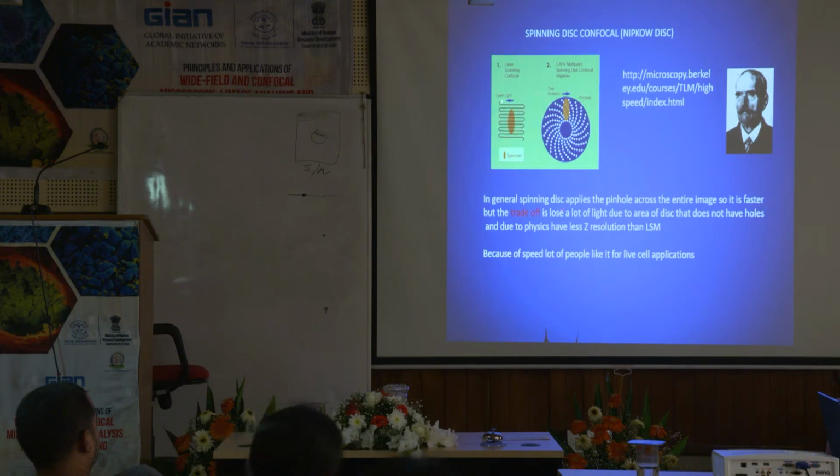Okay, but always, of course, the trade-off is you lose an awful lot of light. Like I sold one of these when they first came out, and it was hard to work with because it just destroyed the light. Because think about it. You have photons of light coming through, but look at all these blue areas where the photons of light hit, and they can't come through. So you lose a ton.